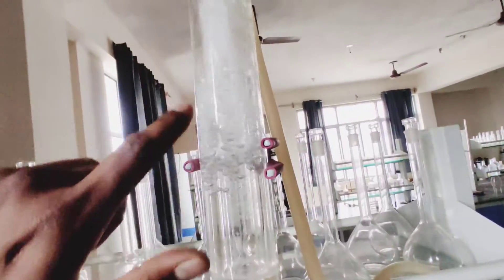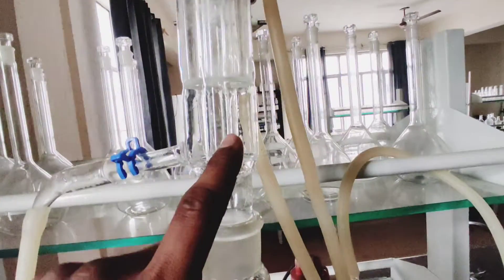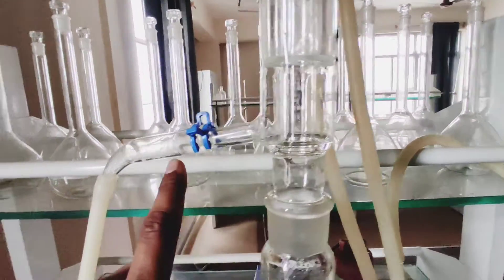And here the water is cold. When it is cold, the steam goes inside. The distilled water is filled with distilled water.